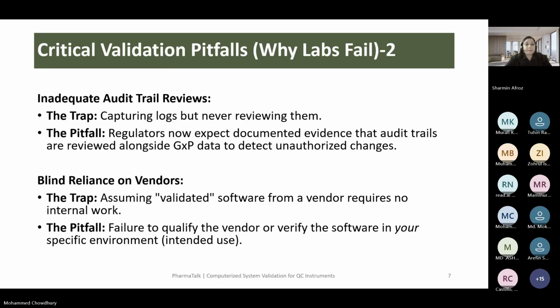Second, blind reliance on vendors. Just because a system is validated by the supplier doesn't mean it's compliant for your use. You still need to qualify the vendor and verify the system within your own environment. So the takeaway is, don't trust the system. Continuously verify and review your software validation. Next slide, please.